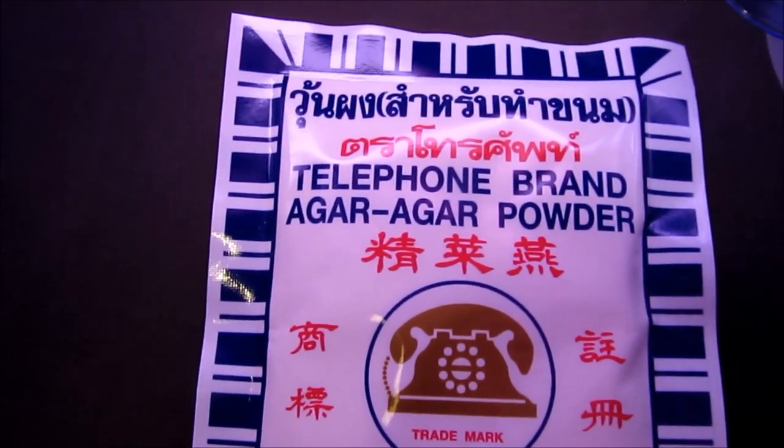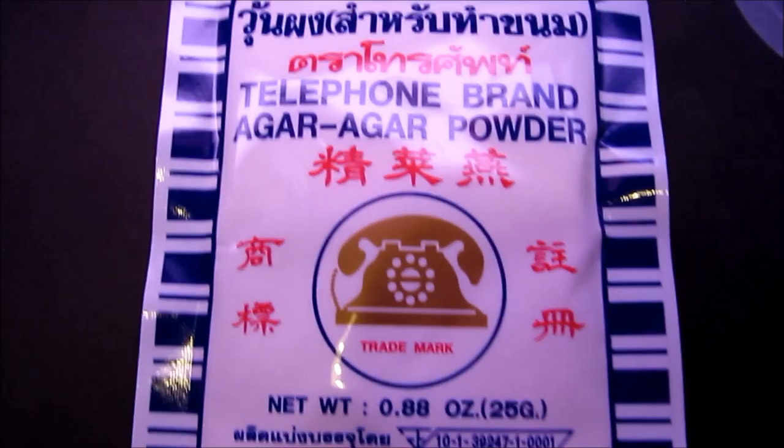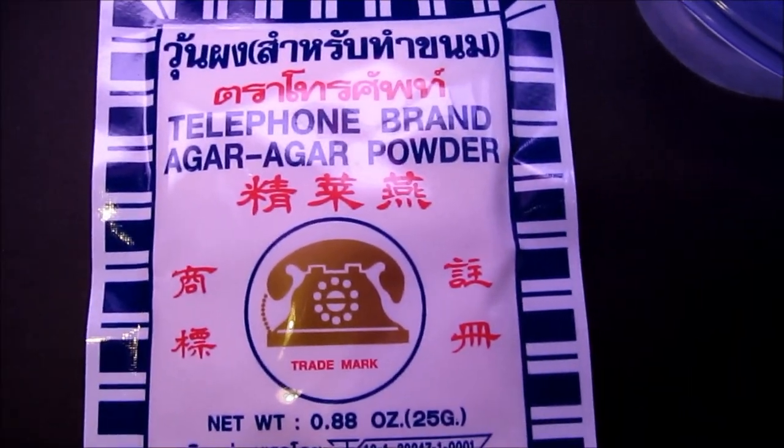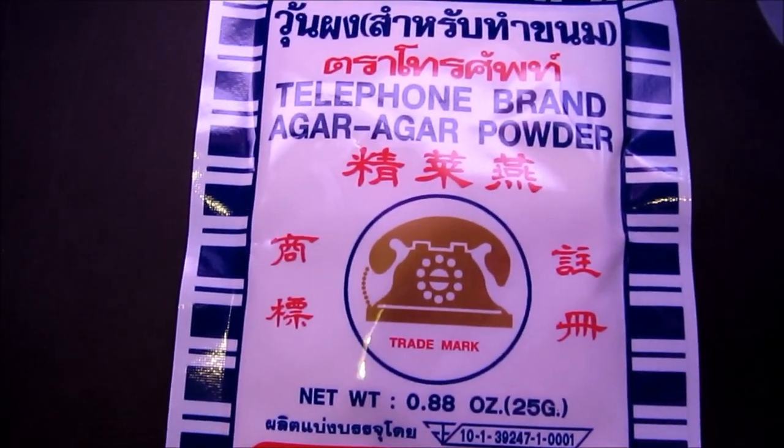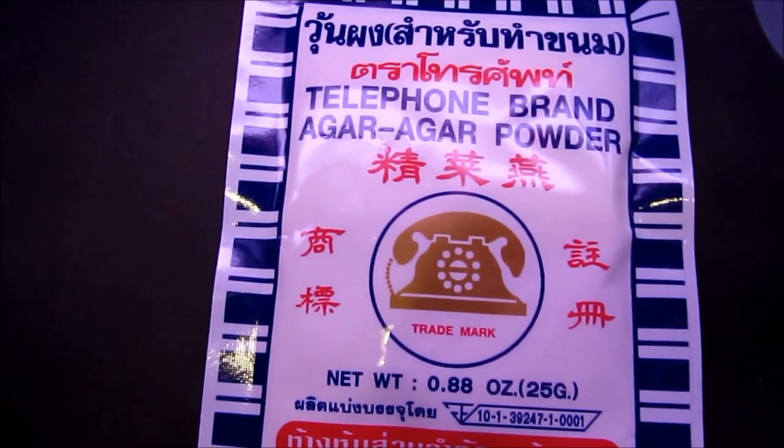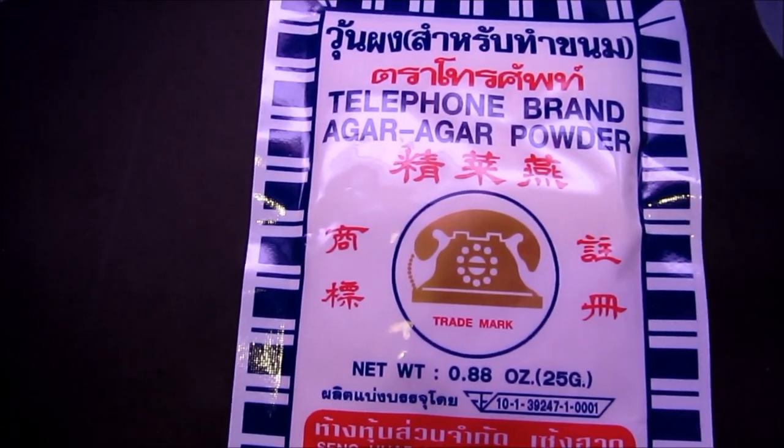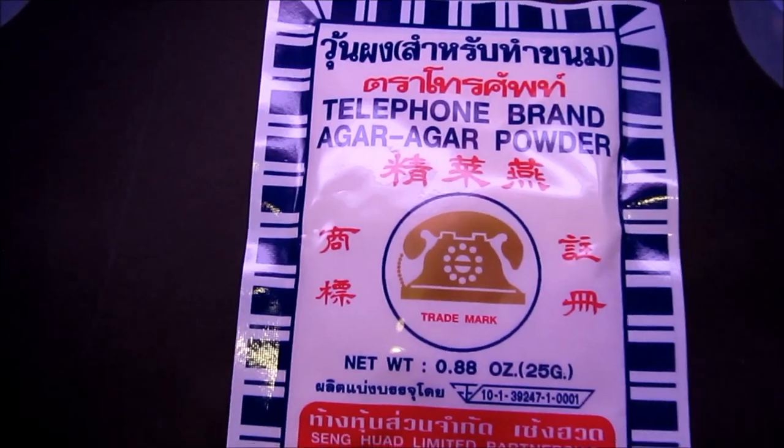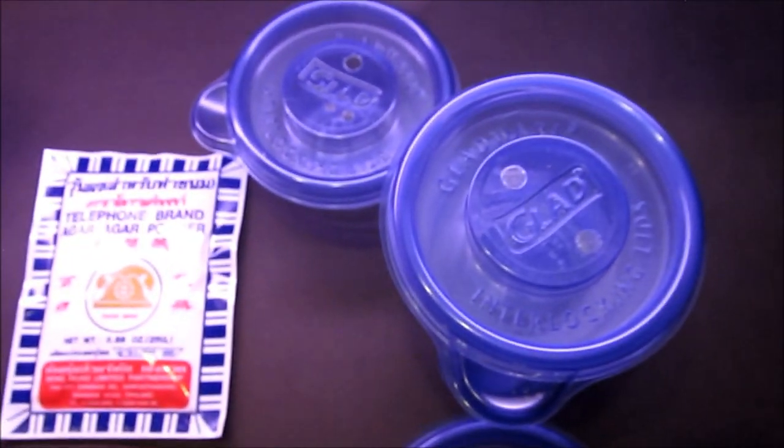Mine keeps it behind the counter for some reason, but Telephone brand agar powder is what you're looking for. Runs like a buck fifty for a package - that's twenty-five grams, so that's probably two batches of agar there for seventy-five cents a batch. The Glad rounds are reusable. Now you're all set, happy pasty plates.